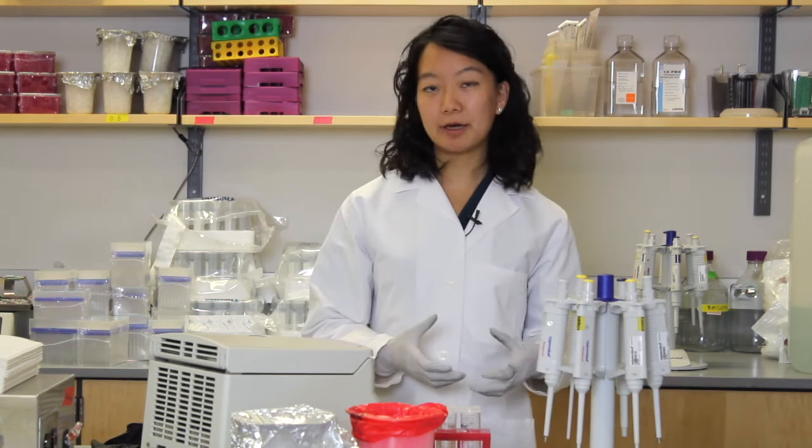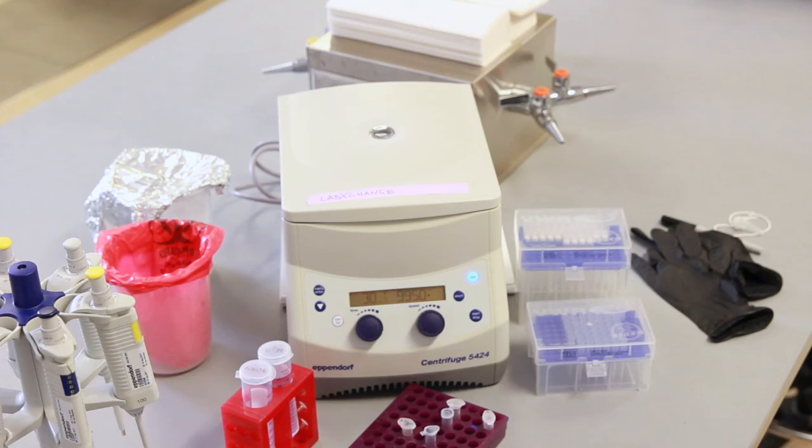Centrifugation in biology is used for several different purposes. We like to use it to gather all of our samples together. We also like to use it to separate out particles within a single sample. Today we're going to be using a basic tabletop centrifuge.